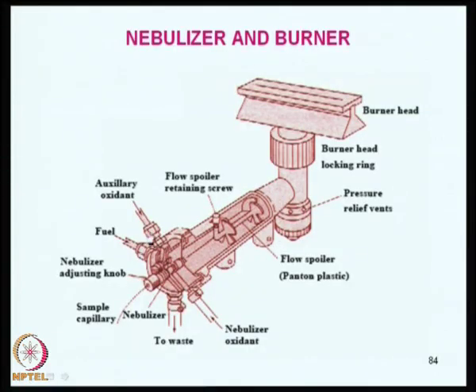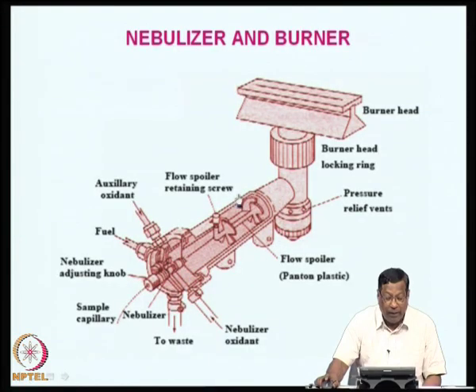In this figure, you can see the part on the left side is the nebulizer. Here you can see a lot of baffles, they are also called flow spoilers.